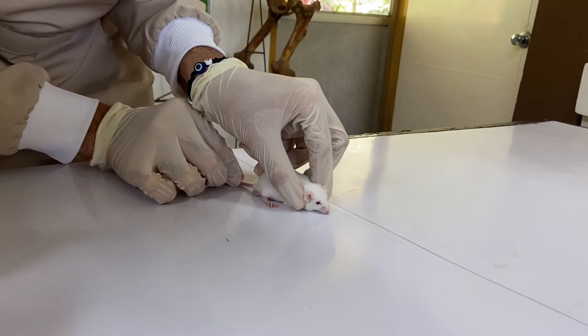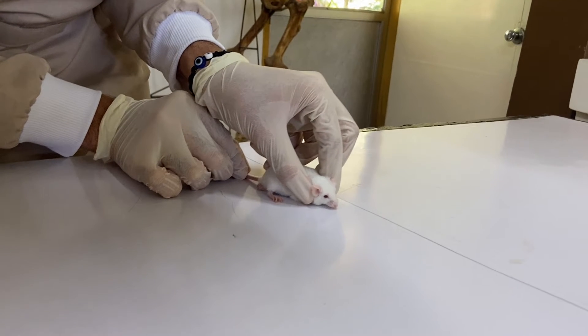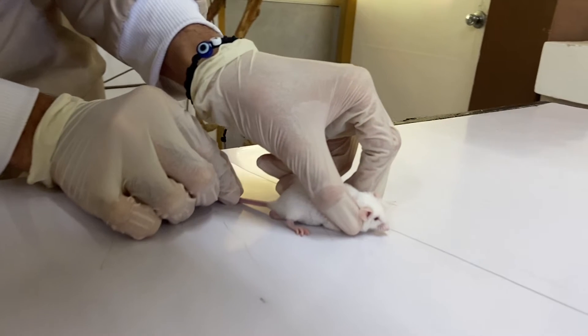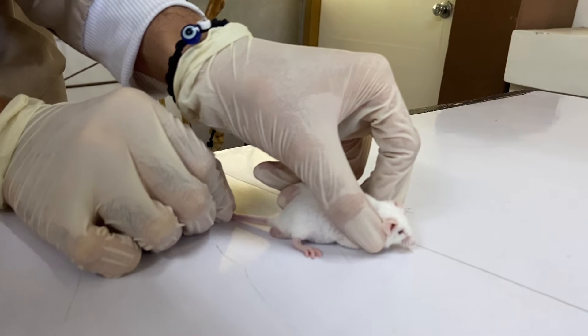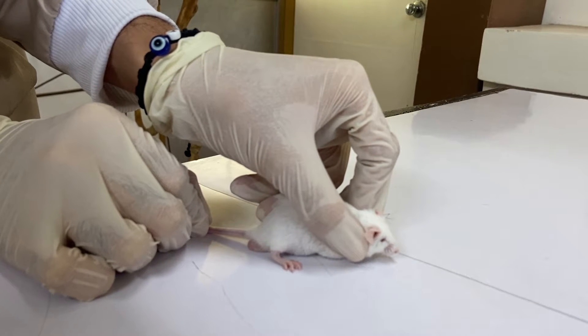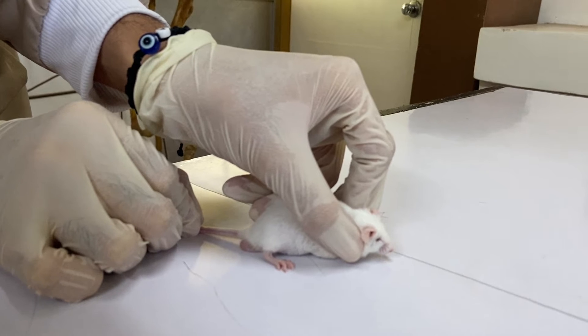Step 2: with the other hand, firmly grasp with the thumb and forefinger the mouse by the loose skin over the neck and shoulders. Step 3: grip quite close to the ears to prevent the animal from turning its head and biting into the handler's fingers.